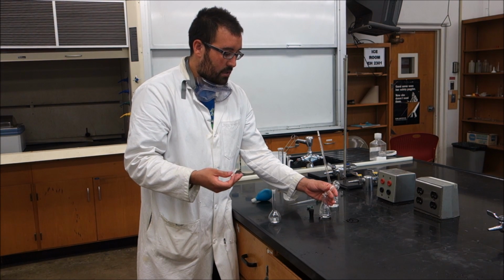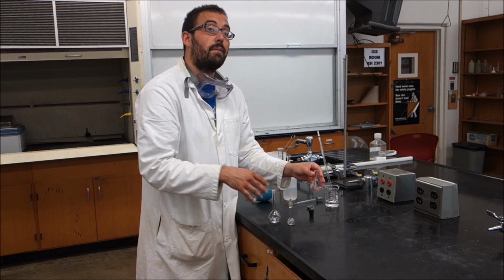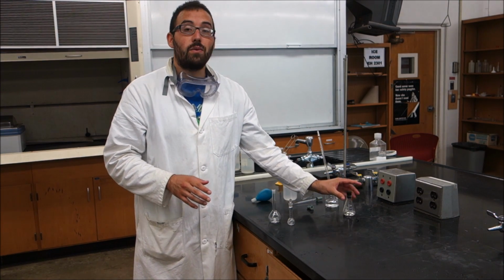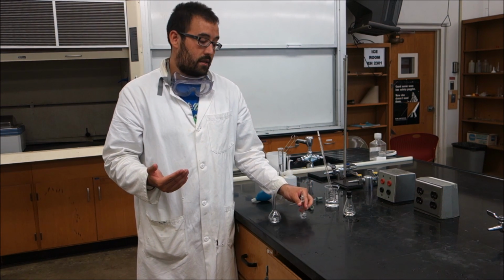And once that's transferred, we can label that with some labeling tape. Now the labeling tape will be located in your lab, and your instructor will show you where it's at. We'll cap this and then we'll store it until we make all of our other solutions. All right, so that's how you do your standard series.